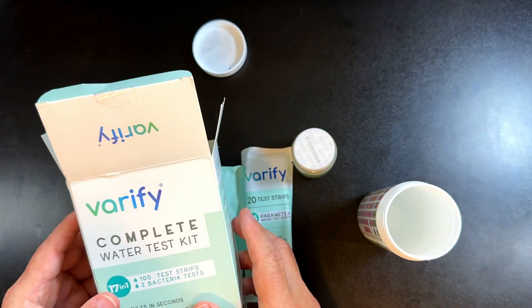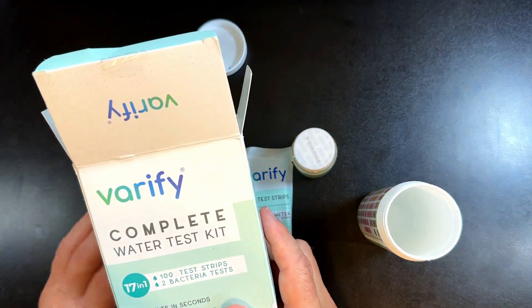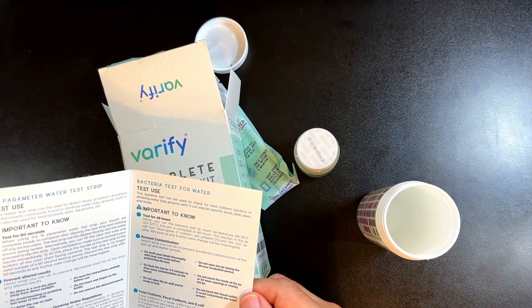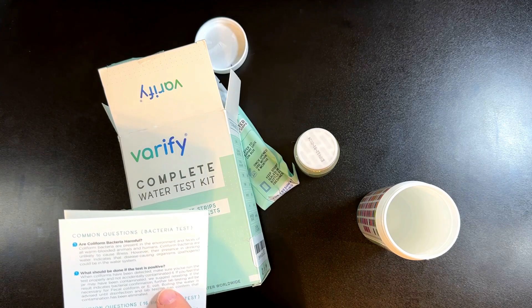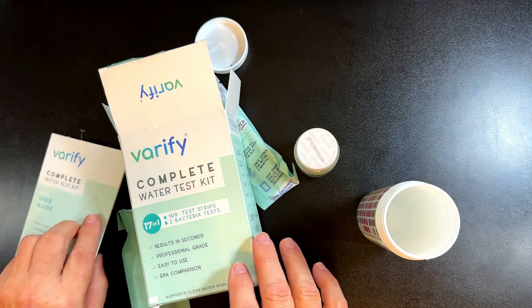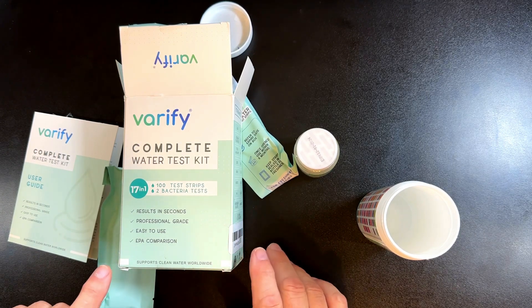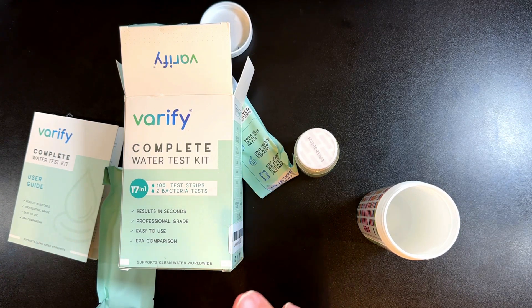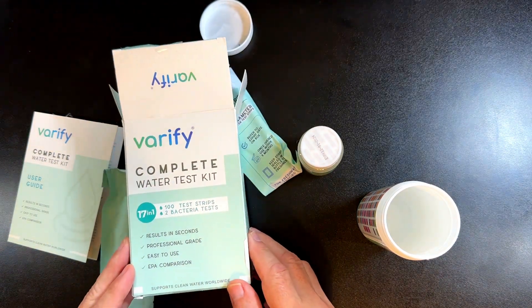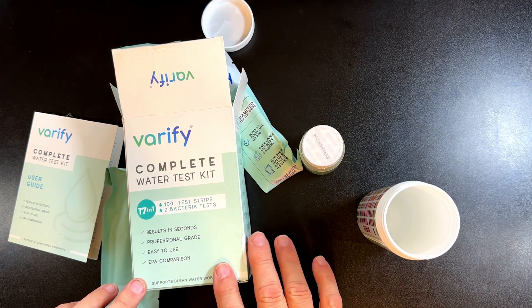The Verify Complete Water Testing Kit — a hundred different tests in this one kit. You really can't beat that. Complete instructions about what to do, how to perform the test, and what to do if you do find bacteria in your water. An excellent test. Thousands of them sold, great reviews, works like a champ. Everybody right now should be testing your water. Find out what your drinking water is like — this is a great way to do it. I'm glad I bought it; I think you will be too. Hope that's going to help you.